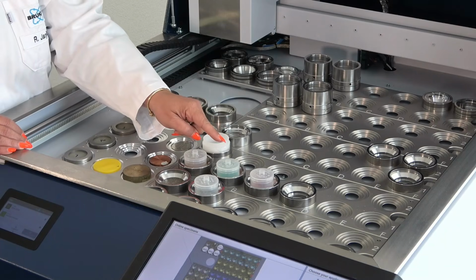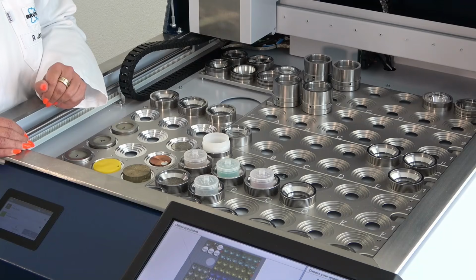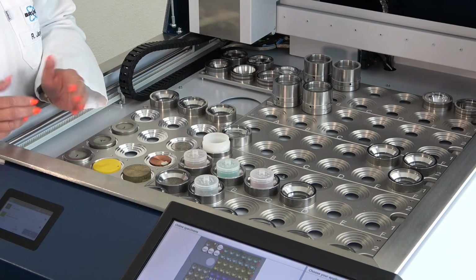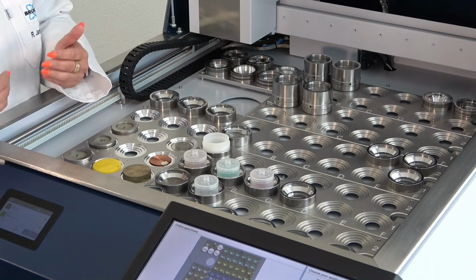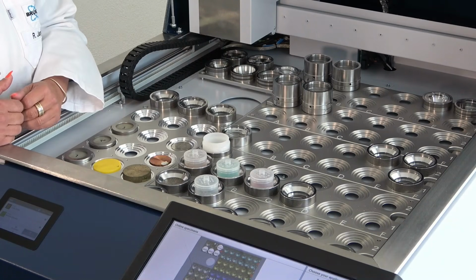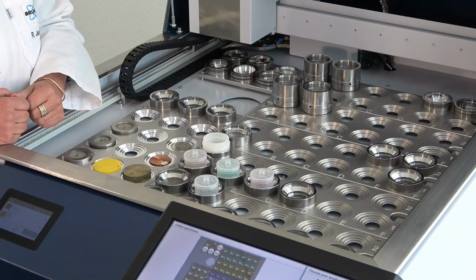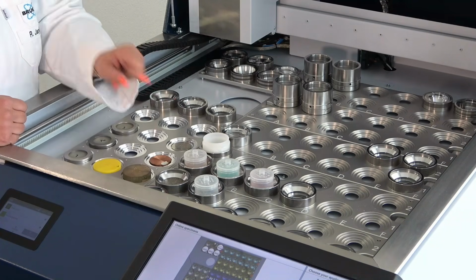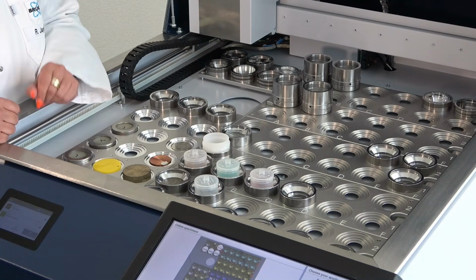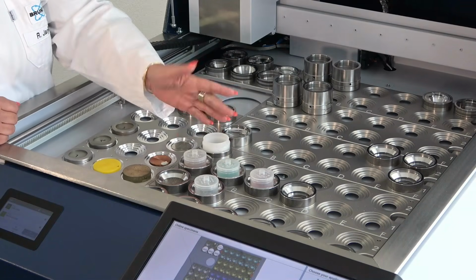What is important for liquid cups, of course, you have to run the liquid samples under helium. We have two different helium modes. Reduced helium mode to save helium and to reduce the costs for mineral oil samples or organic samples, powders. And we also have an atmospheric helium mode, which is only used if you have some volatile samples, for example, like gasoline. Measurement time is something I have told you, but I will give you some more information about this later on. And of course, it's not possible to run a liquid sample under vacuum.